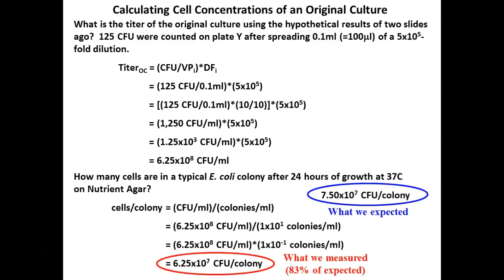So we would expect maybe this number, and that's not quite as much as what we expected, but pretty darn close. So we'll see what we actually get this semester, right? And I actually did staph, so just change it up a little bit, see what we got, right? And we have our OD reading we'll be able to compare it to, and I'll also figure out what the volume of our media that we started out with was.